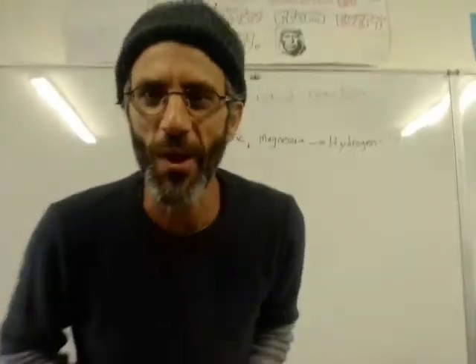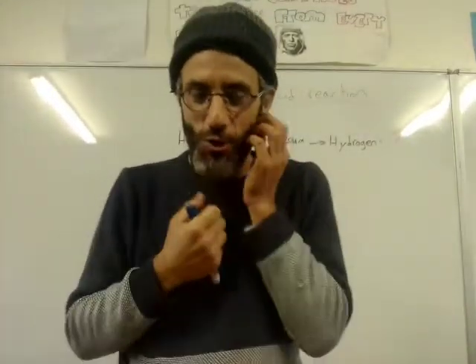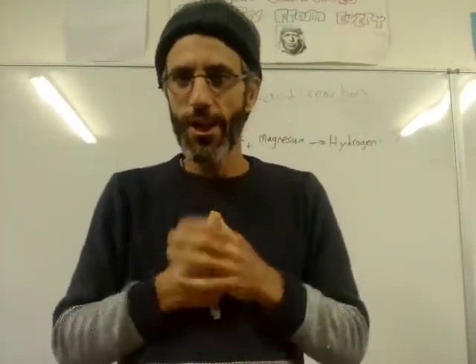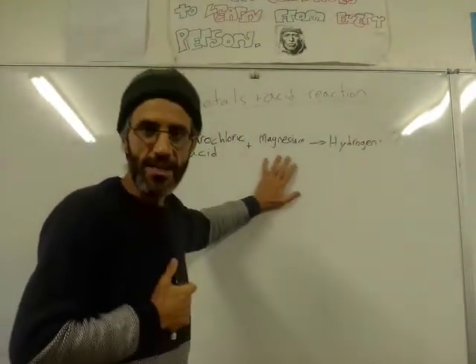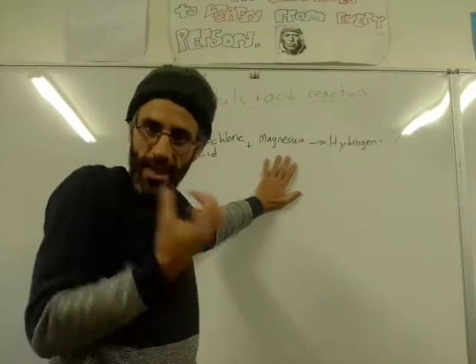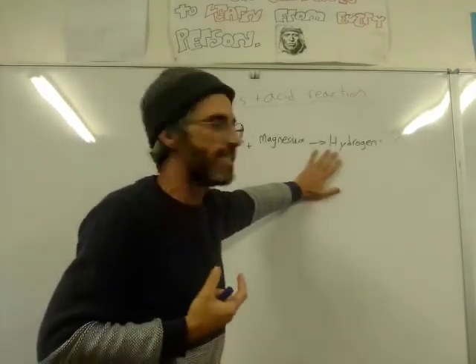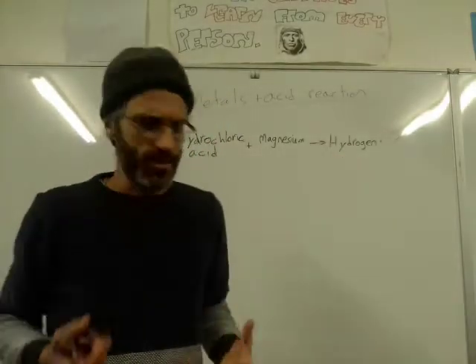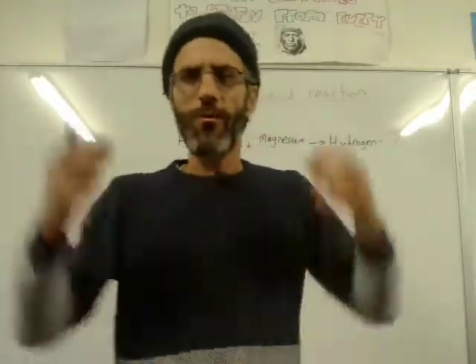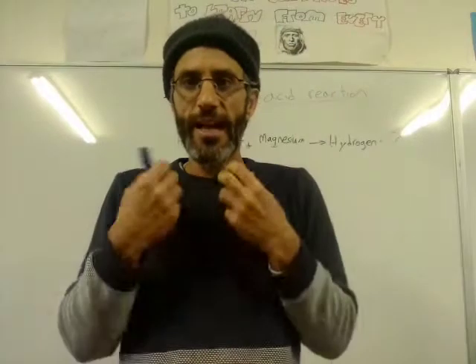Okay, let's write that on the board. Okay, so now we're back on the board. So let's try and find out theoretically what actually happened here. We had hydrochloric acid, we added magnesium to it, and we saw that the gas was released. We identified it as hydrogen. Okay? Now, there's something else. There was still liquid there. Some of the acid remained there, but there was actually something else.